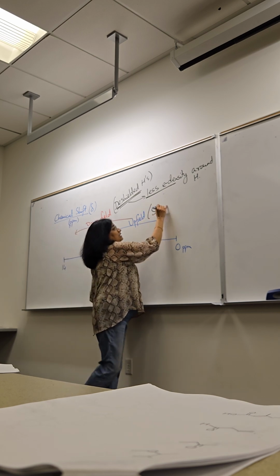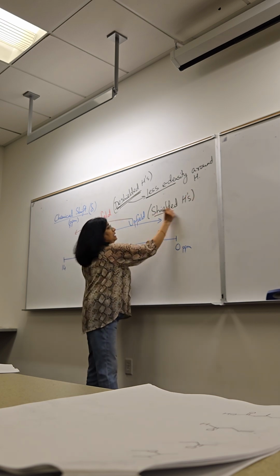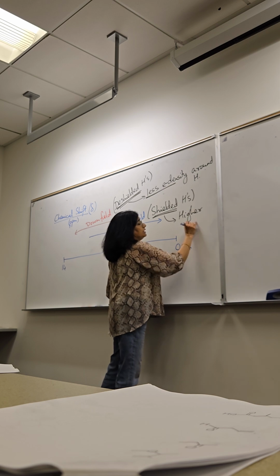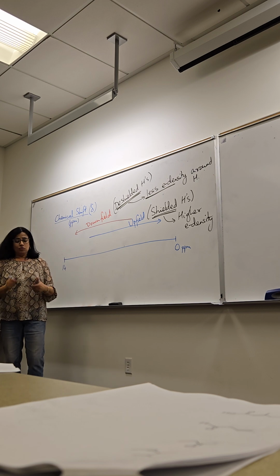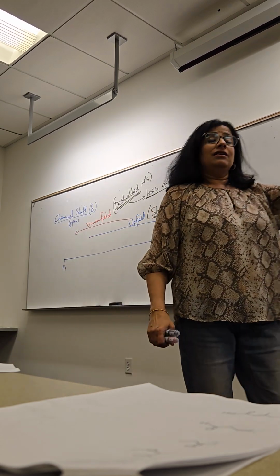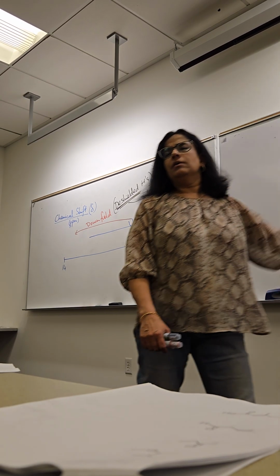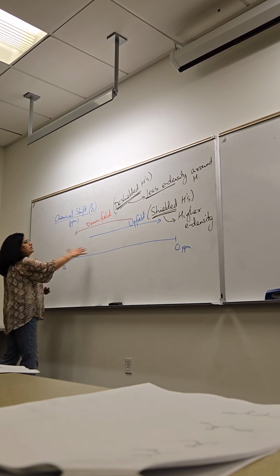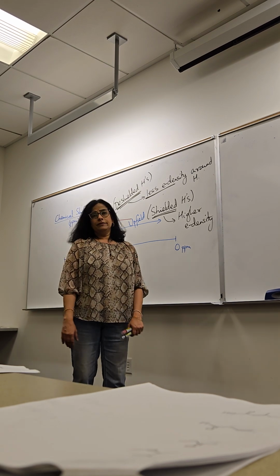The more shielded by the electron cloud hydrogens are, meaning they have higher electron density around them, the more upfield the signal will be, which is a lower ppm value. So just some terms: if you hear those terms, downfield means higher ppm, upfield means lower ppm. Are we all okay so far?